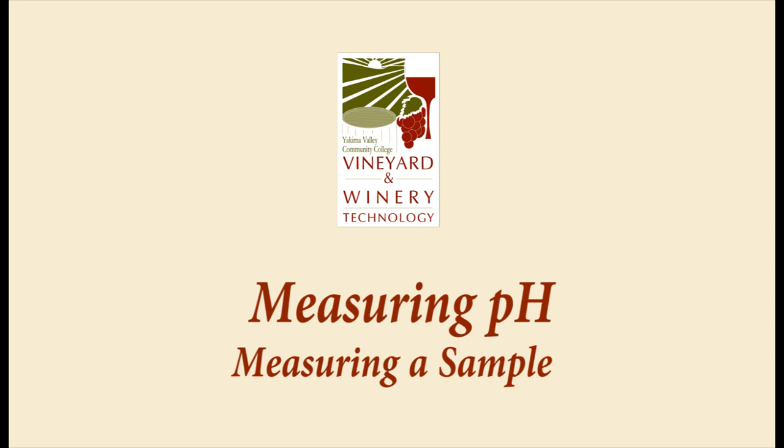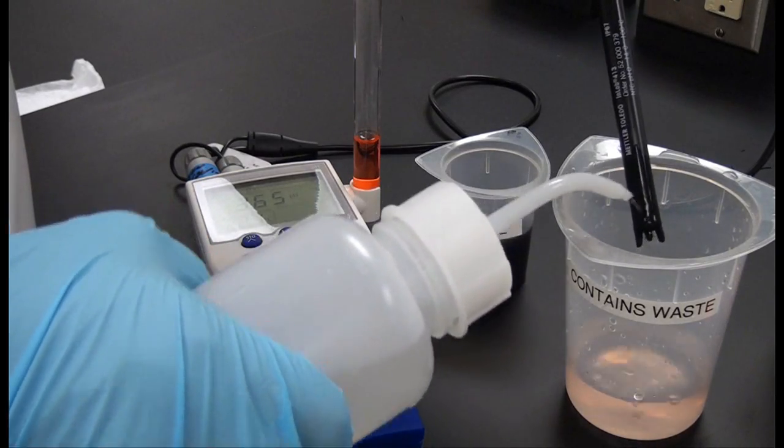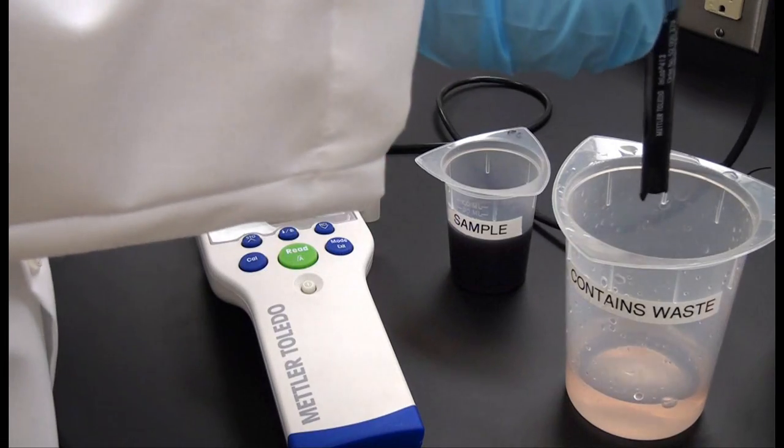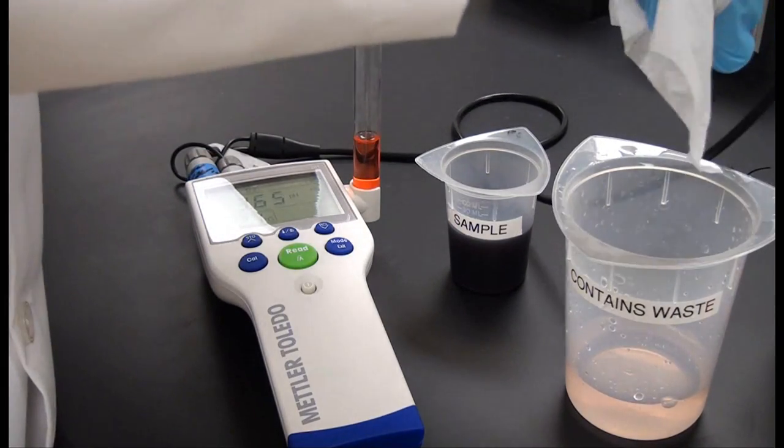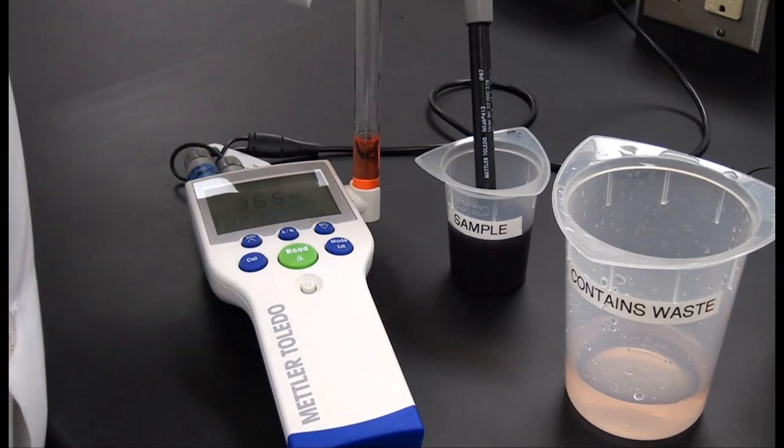Now let's take a look at pH sample measurements. Rinse the electrode with DI water prior to placing it into the sample. Place the electrode in the sample and press the read button to start the measurement. The decimal point will begin to blink. The display will begin to show the pH of the sample.